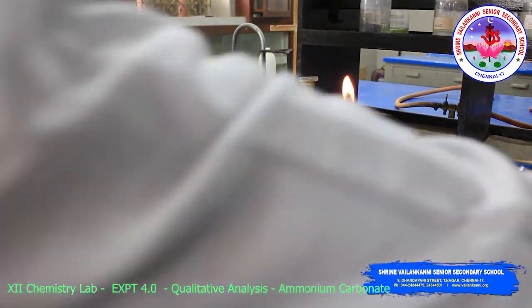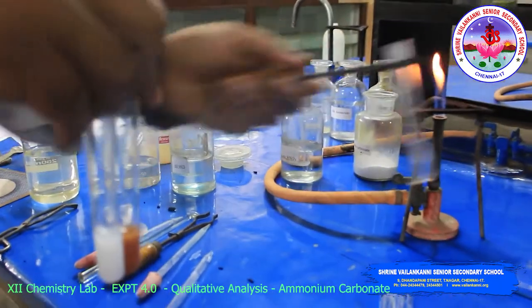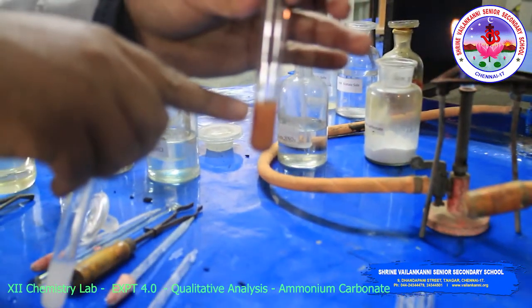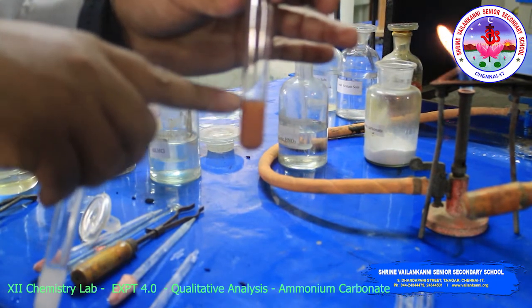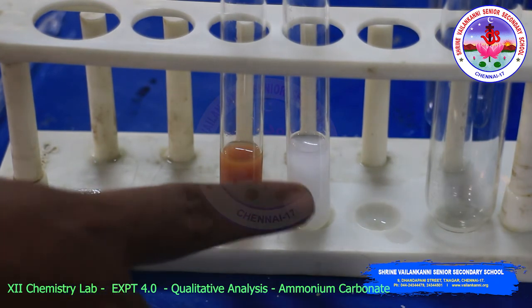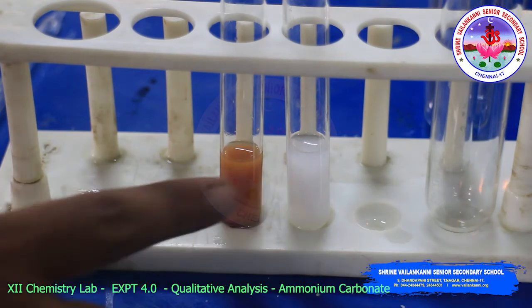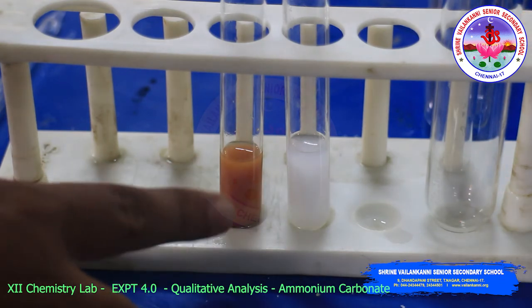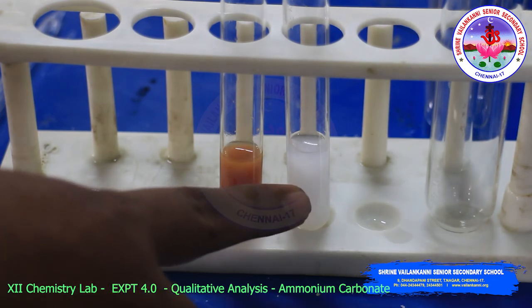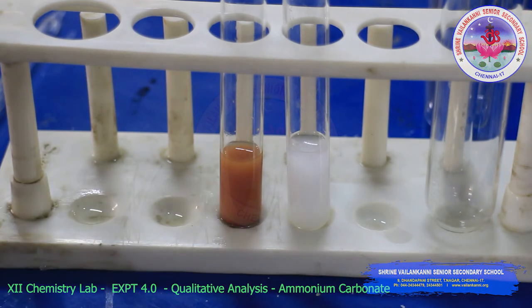Now you can see the tests for acid and basic radicals. This is the test for basic radicals. Ammonium is confirmed. Look, the confirmation test for basic radical and the confirmation test for acidic radical. The acid radical here is carbonate, and the basic is ammonium. For ammonium, a brown precipitate is obtained, and a white precipitate for carbonate, that is the magnesium sulfate test. Okay, now we will do the next salt.